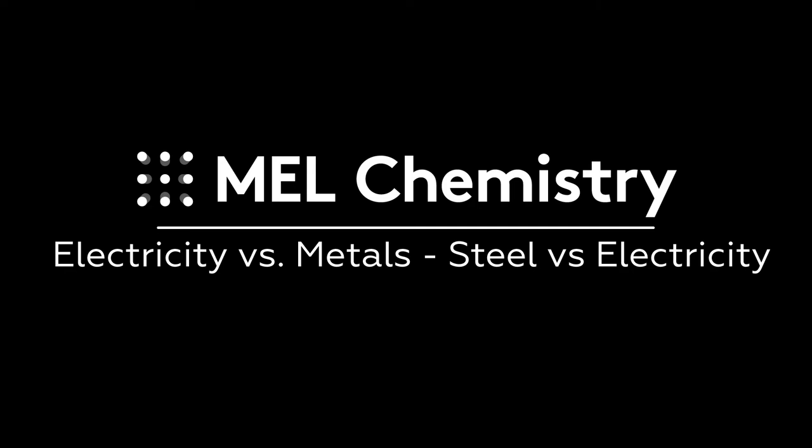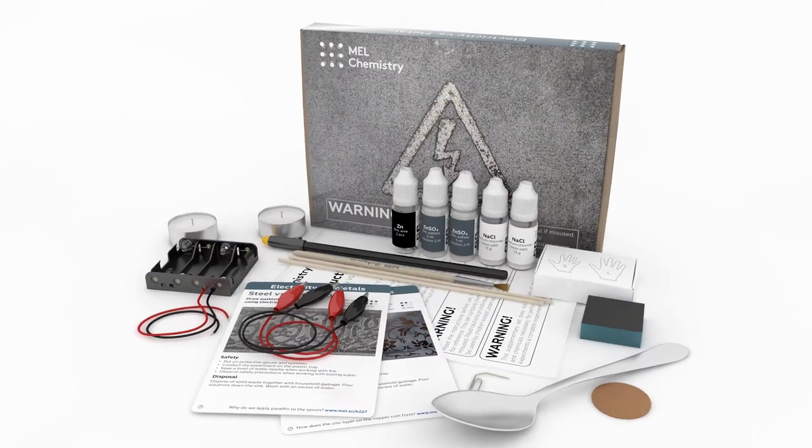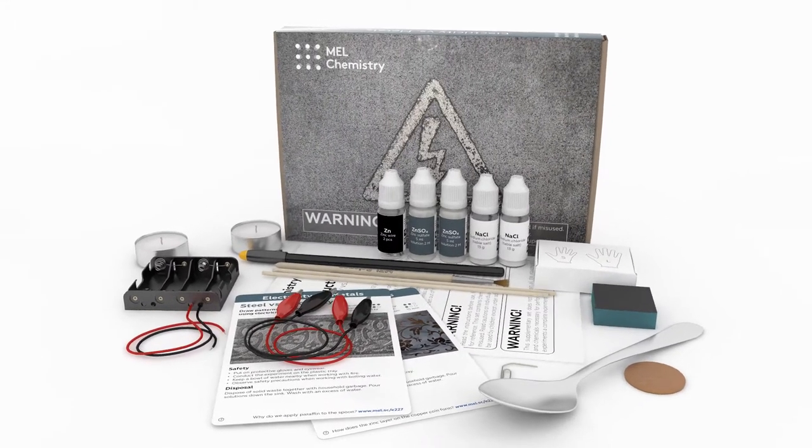Welcome to the wonderful world of chemistry. Today, with the help of the metals versus electricity set by Mel Chemistry, we will use electricity to make patterns on an iron spoon.